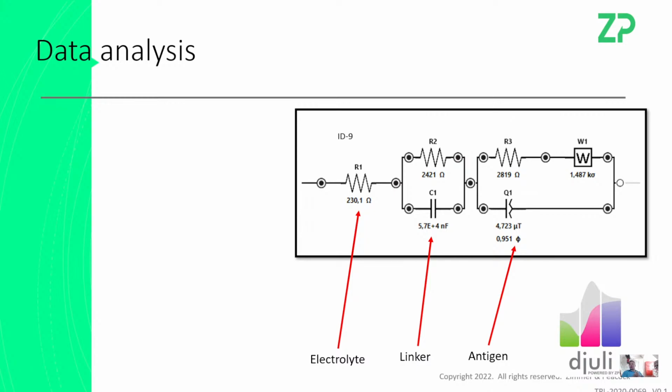If you're using gold, try carbon. If you're using carbon, try gold. And really, is your equivalent circuit, the RCT value, are you using a very simple Randles circuit, or are you using something more complicated? Because in this circuit, I could easily see that, as I say, if R3 goes up and R2 goes down, then it's going to start confusing you.